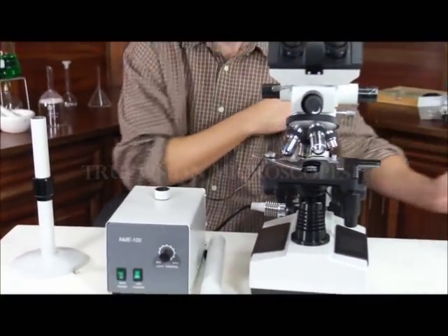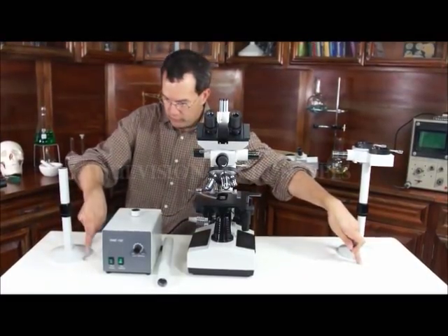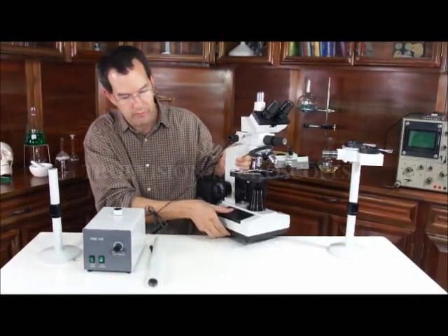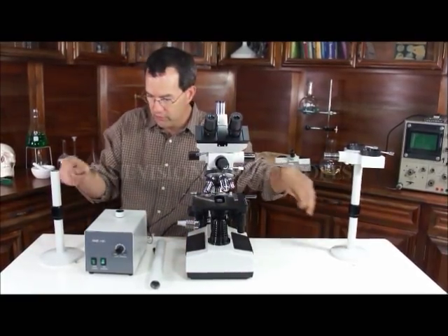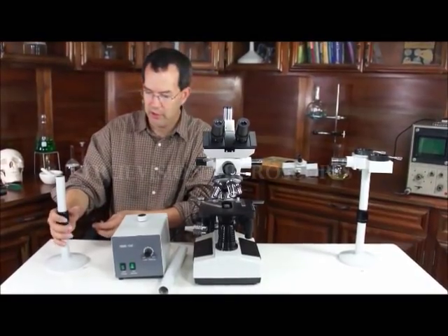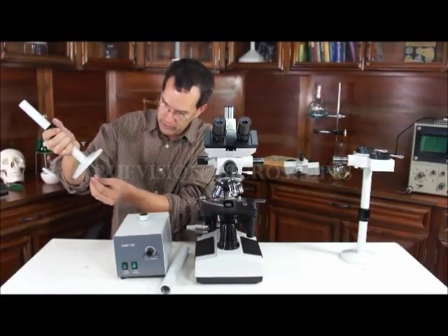One thing about this table: this is not the best table, this is a simple table. You can use any table you want — just pre-drill these holes as needed. There's no hole in the middle, so take any table and drill two holes. Especially when we ship these outside the U.S. to a foreign destination, we usually don't ship the table. Customers find it more economical to get their own table, drill two holes, and make it work.